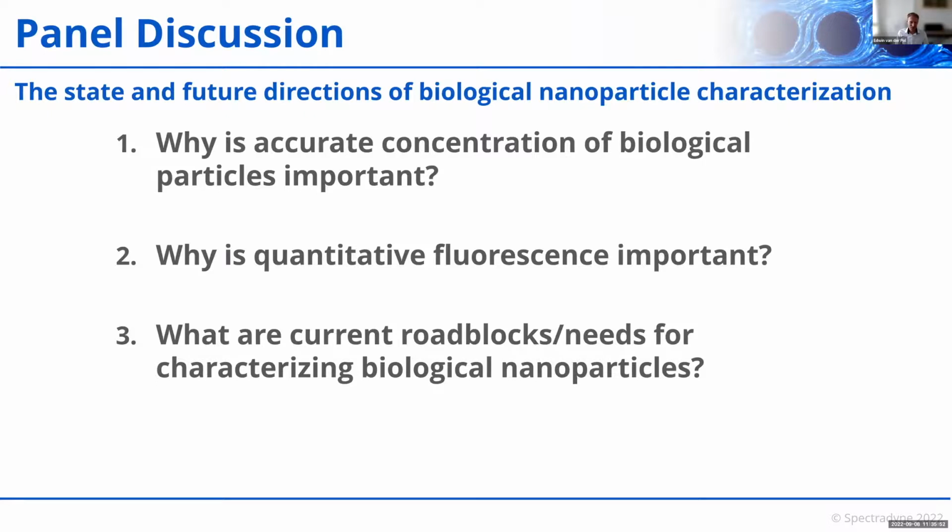This is a very broad question, and of course very experiment specific. What I think are the current roadblocks is perhaps a mixture between detection and isolation, because if you look at the field, there are two major streams, at least the field of EVs, but I think that accounts for many fields.